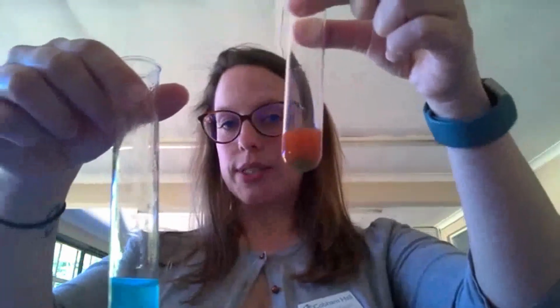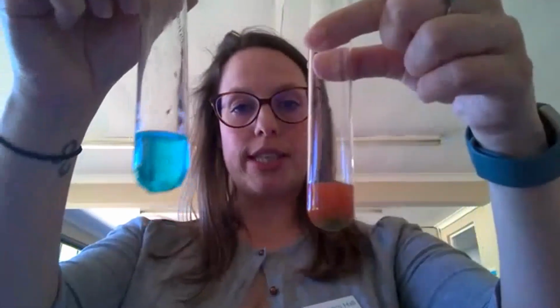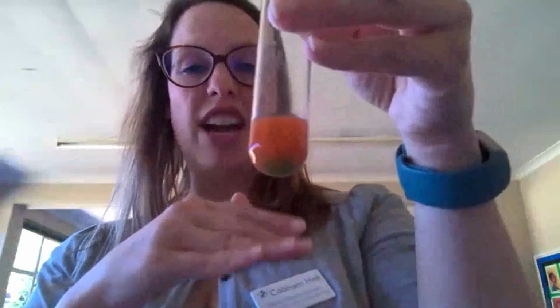However, I can see that I have had a colour change. This one is the one that had the glucose in it, and this was just water from the tap. This has stayed blue, which is the same colour as your Benedict's reagent. This one is orange, though you can't very clearly see that. There is still a bit of blue-grey at the bottom because it hasn't fully changed colour yet. If we left it a little bit longer, it would all go orange or red, and that is a positive test for sugars.